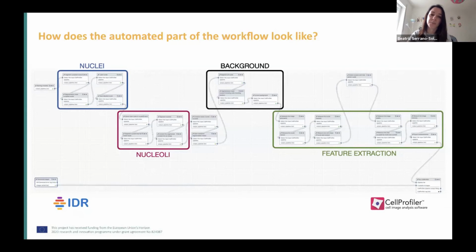This is important, especially for quality control, because that would help us to detect some low contrast images or bright backgrounds that are not helpful for the study. So it's mostly to detect artifacts.